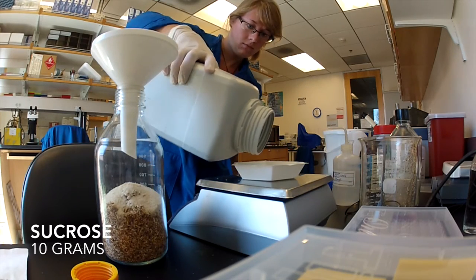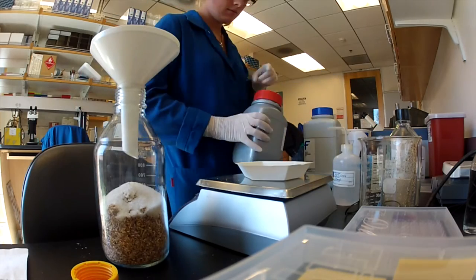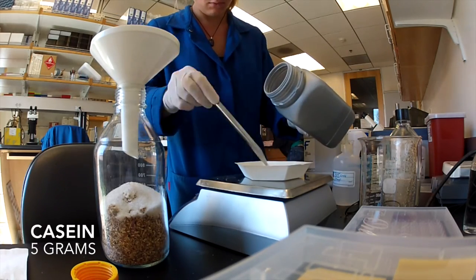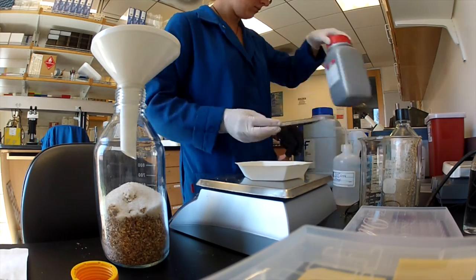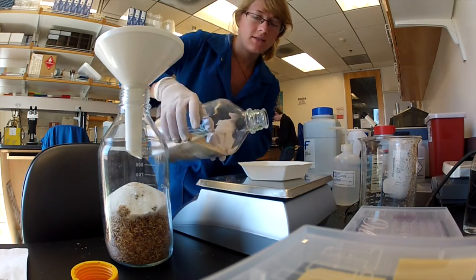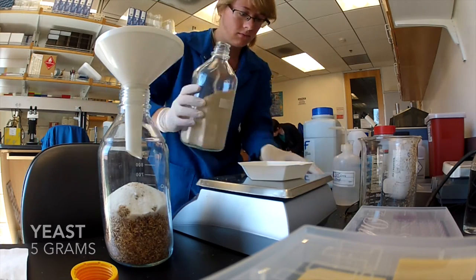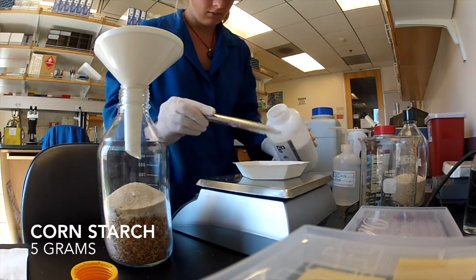Next, add 10 grams of sucrose. Next, we add 5 grams of casein. The next ingredient is 5 grams of active dry yeast, which should be stored in the fridge when it's not being used. The next ingredient is 5 grams of cornstarch.